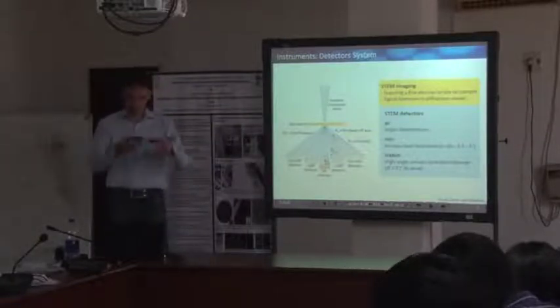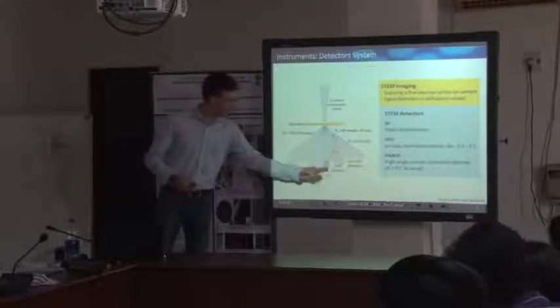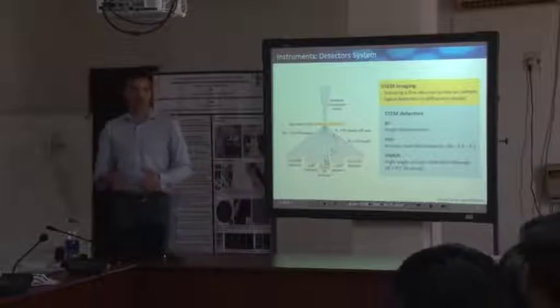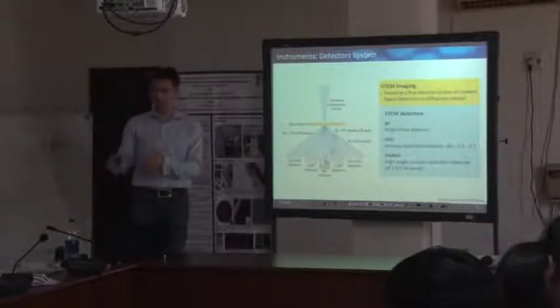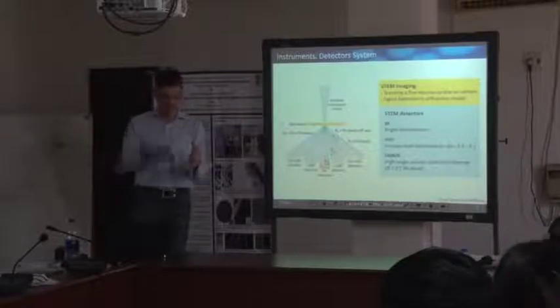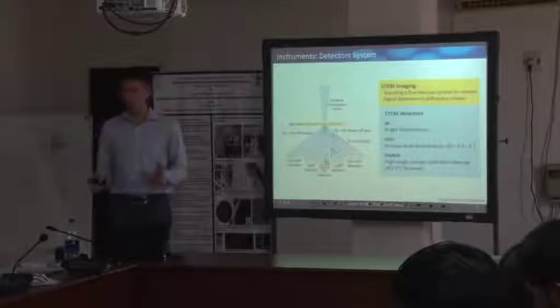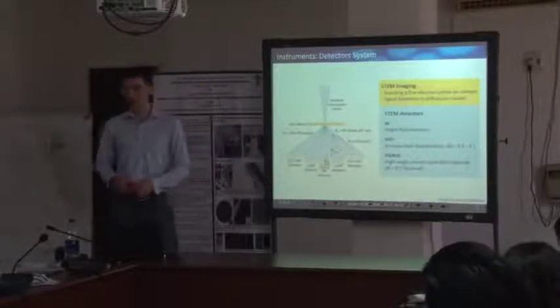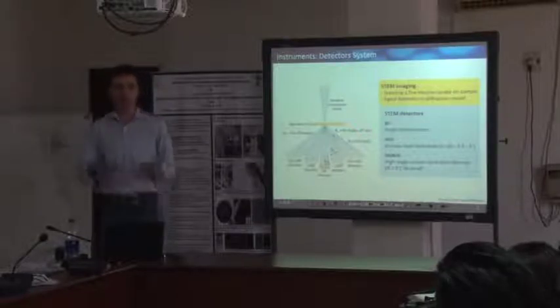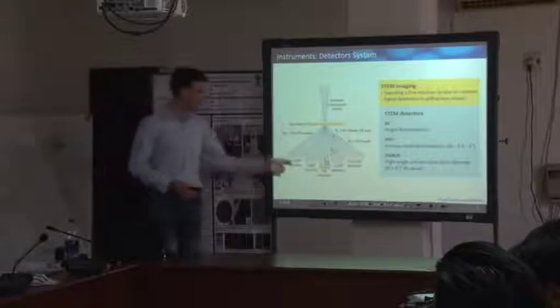If you do so, if you record those diffracted beams and you connect those with the detector, you will definitely end up with some diffraction contrast, because we know that the excitation of those diffracted beams and the intensity depends on the structure factor and on the orientation of our crystal. So we would see lattice defects, and we would see different grains and different orientations of grains.